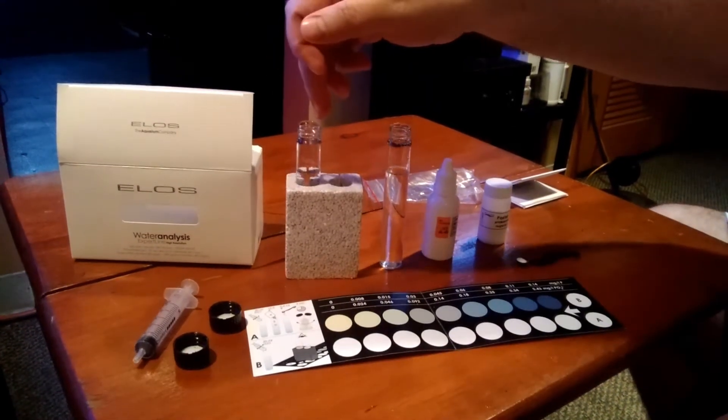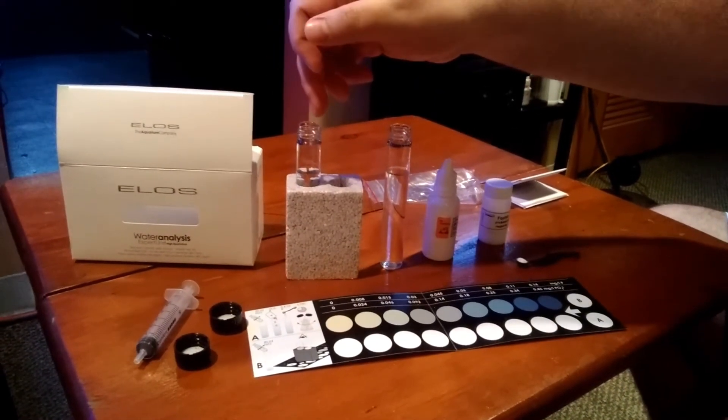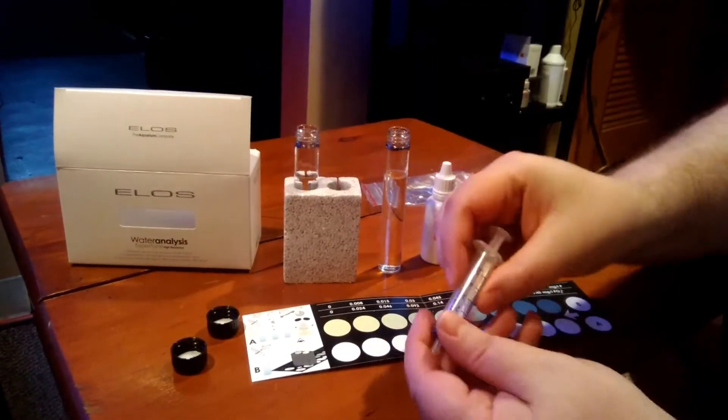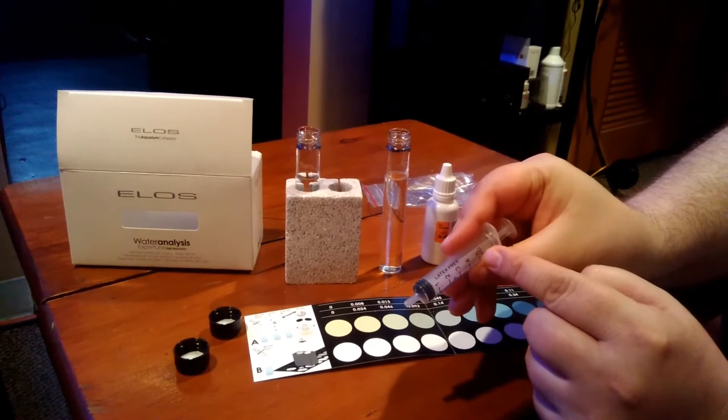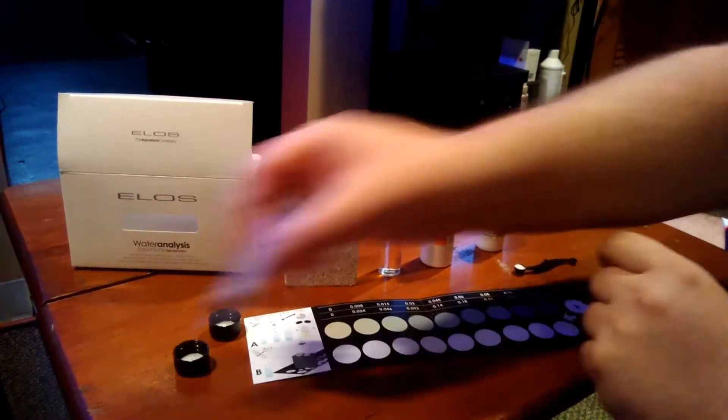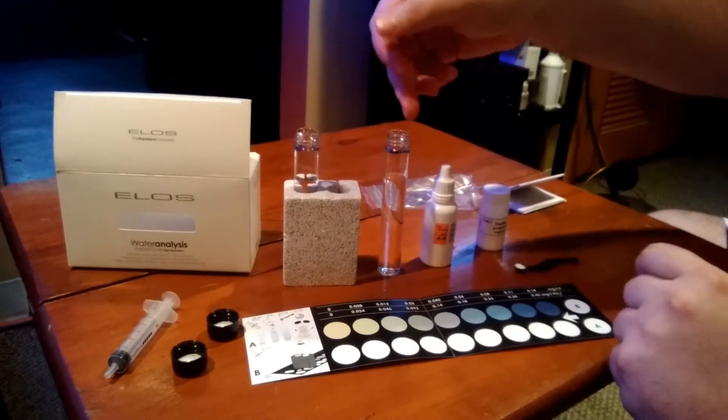This one you're going to fill up with H2O — your tank water — and you're going to fill it up four times because you need 20 milliliters and this is 5 milliliters. You're going to do the same with the other vial.